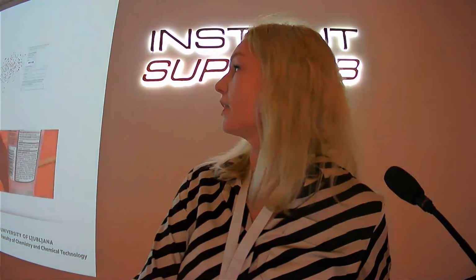First part will be about the preparation of different microplastics for the laboratory research. And then the next step, a little bit about the characterization, and the last part about the aging and weathering, because this is something that we are doing quite often and quite a lot.